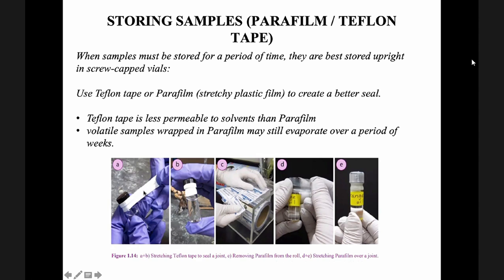So what is best? Use Teflon tape as much as possible. Okay, ang parafilm still evaporate over a period of weeks. Ma-evaporate siya pa ang mga samples, so pwede pa siya maka-escape. But for the Teflon tape, less ang permeability niya.